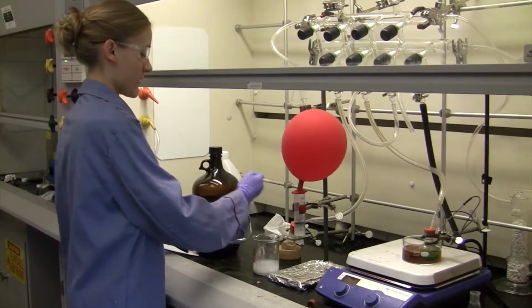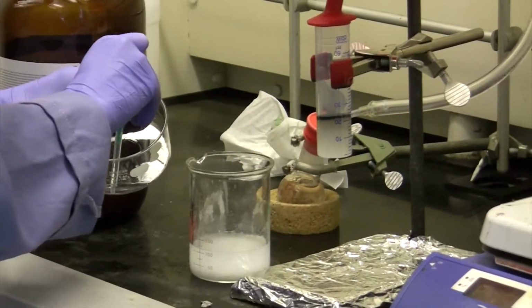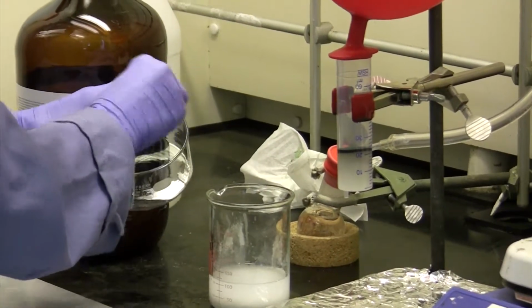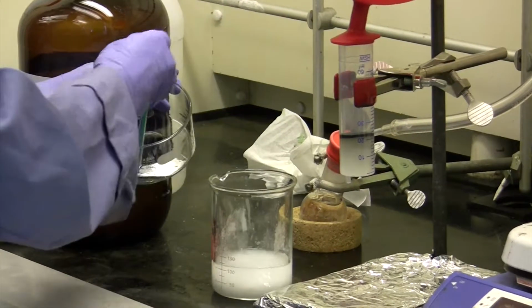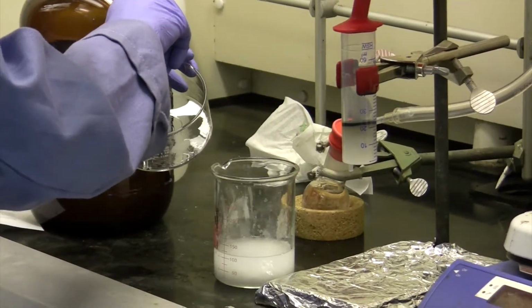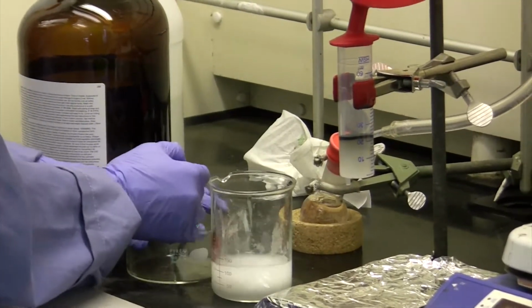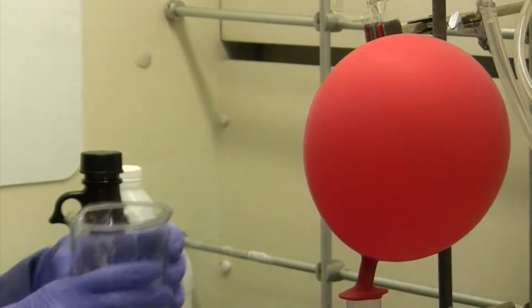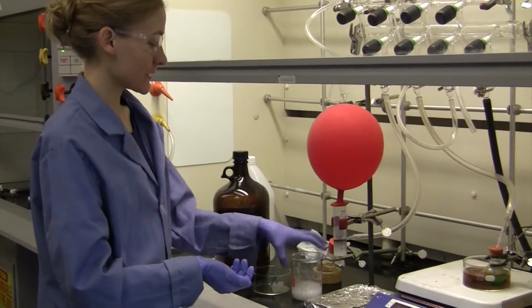See it come right out, nice and cloudy. It's white, cloudy stuff, that means you made a good polymer. You can see, very white, so we have a lot of good polymer in there. And now all we'll do is transfer this to a centrifuge tube, and we'll centrifuge it to collect the solids at the bottom. That's all for today.